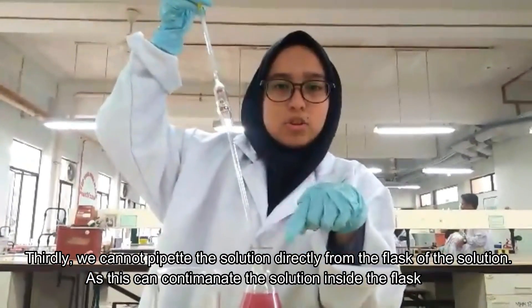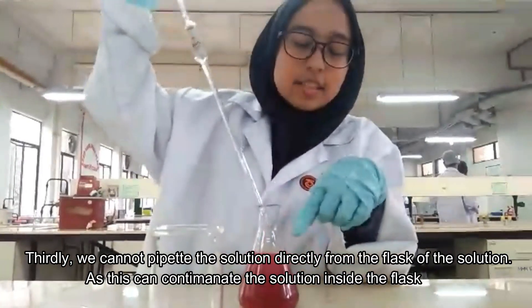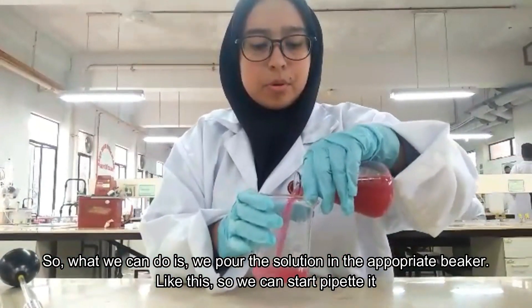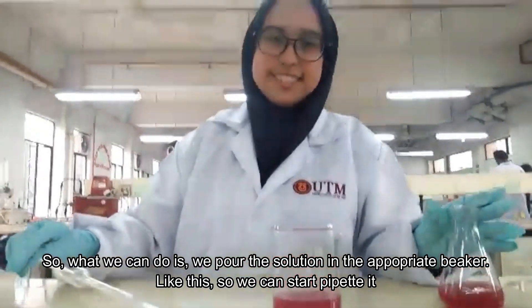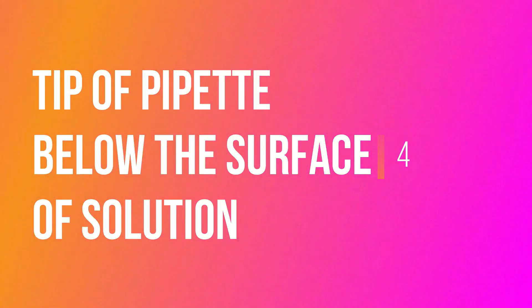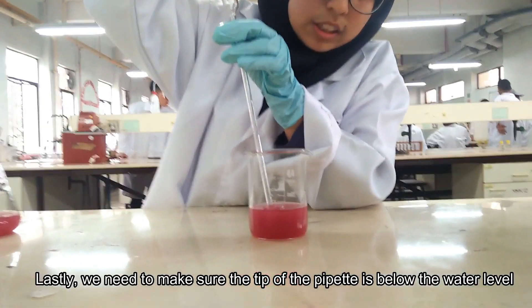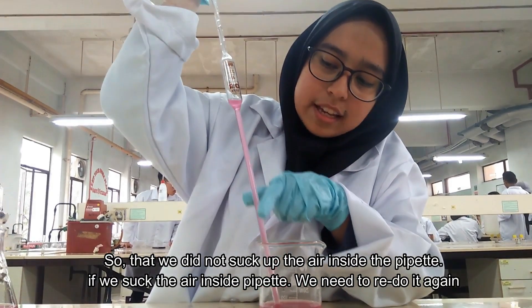We cannot pipette the solution directly from the flask, as this can contaminate the solution inside the flask. What we can do is pour the solution into an appropriate container, and then we can start to pipette. We need to make sure the tip of the pipette is below the water level so that we do not suck up air into the pipette.